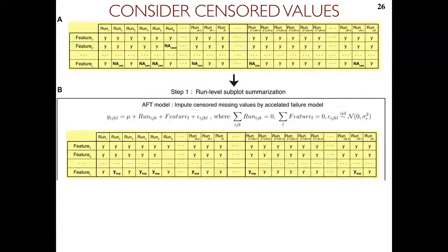And so now, in terms of censoring, we actually have ways. For this type of two-way table, it's essentially a two-way analysis of variance with censoring, where we fit a linear model which allows us to account for the fact that some of these values are missing. And this is a very standard way of doing this. The problem with that is that it will take care of missing values, but it will not take care of outliers. And so what we want to do now is to have a model which simultaneously incorporates censoring and incorporates robust summarization. And there's again a statistical literature.